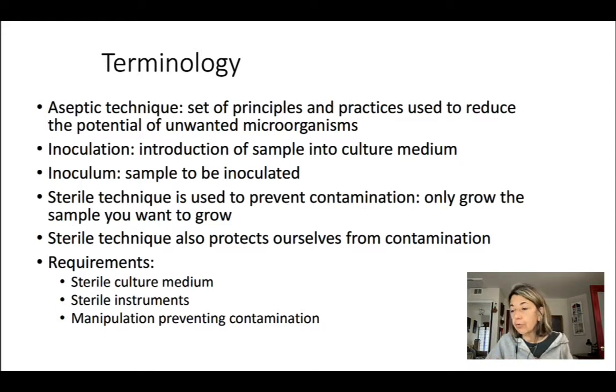And I do know for a fact that blood cultures, which are critical to diagnose, for example, sepsis, are notoriously prone to contamination, because when the samples are taken, they are very often contaminated with microbes from the skin of the patient. So again, it's a set of principles and practices. They reduce the potential of unwanted microbes in the culture, but also it protects yourself.